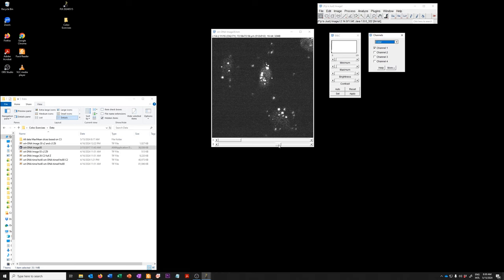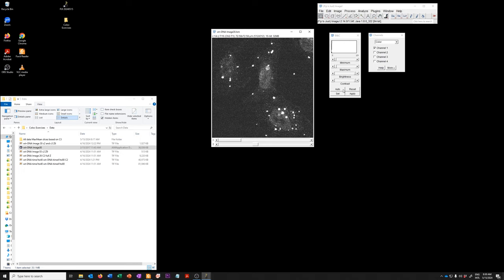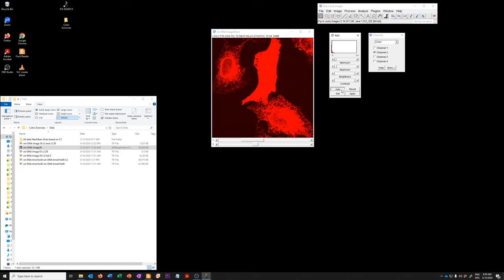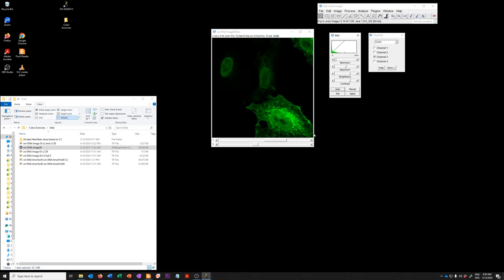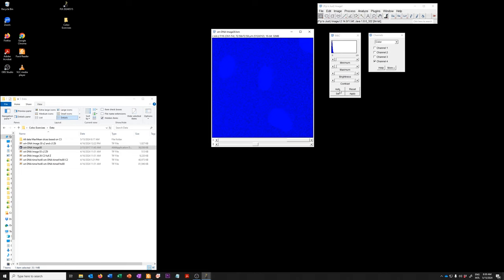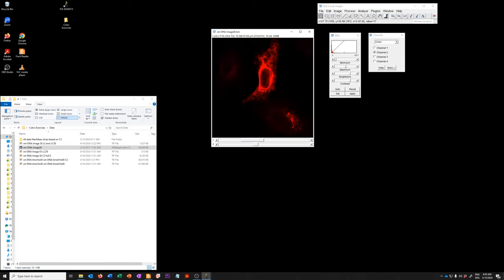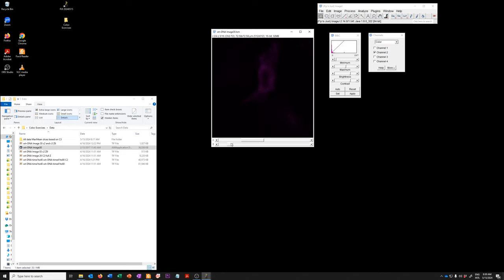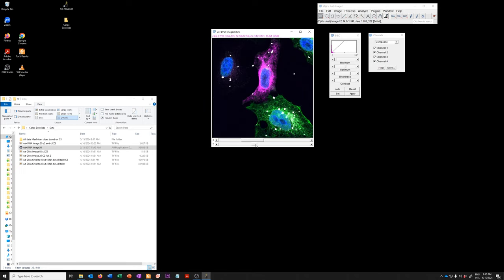This allows me to more easily navigate this data. I might want to go to the middle and auto-adjust the contrast in the different channels. Maybe change this channel instead of red, make that one magenta, and so on. And maybe look at them together.